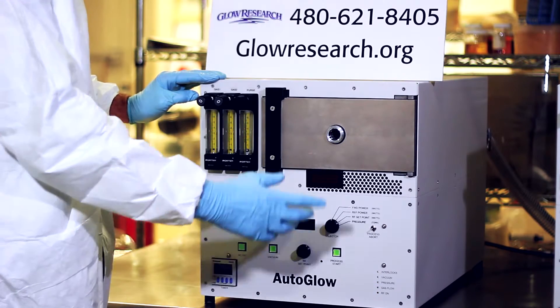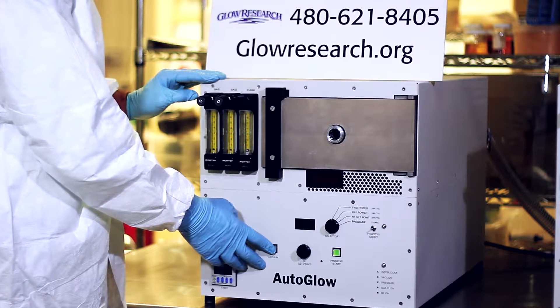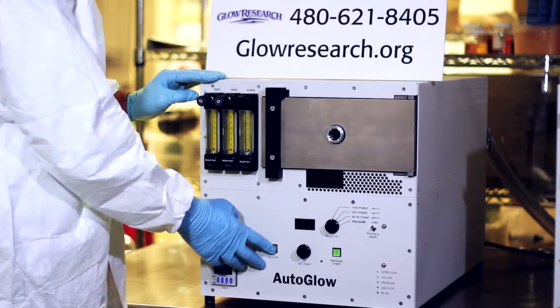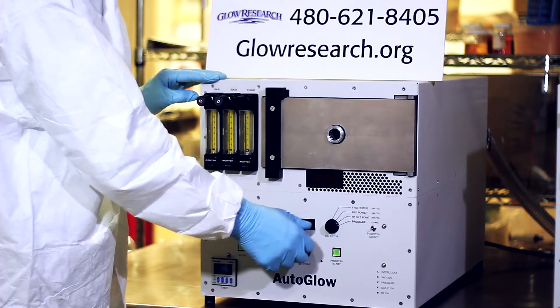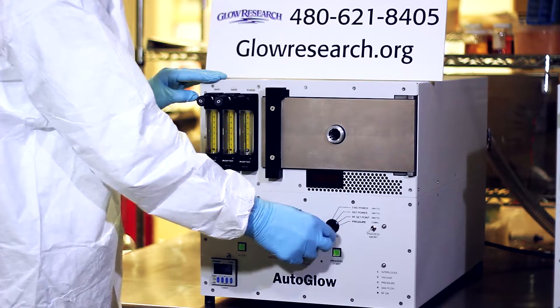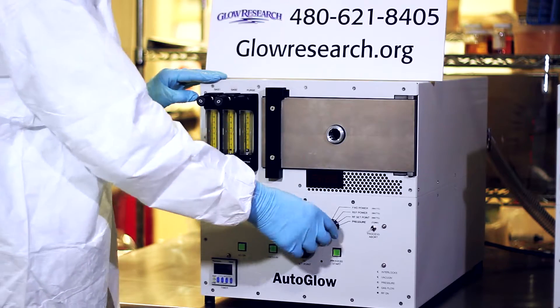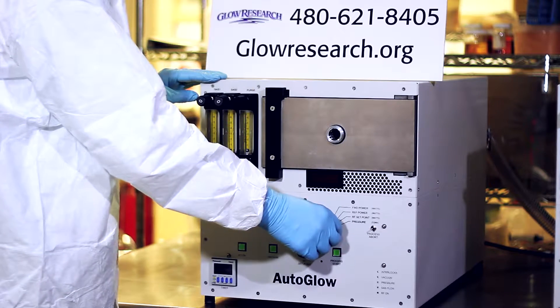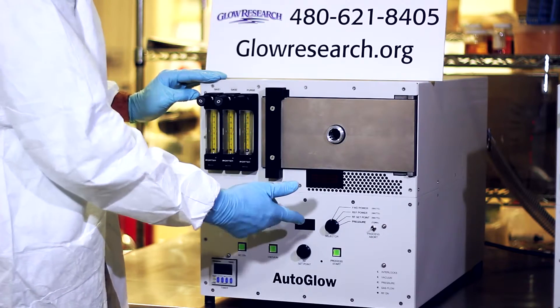I'll describe the operation and we'll come back and actually turn it on. Here's the AC on, then you would press your vacuum which would close the vacuum valve allowing the chamber to pump down. Here is a selector switch where you can select the pressure. We have a Pirani gauge to give you a very accurate reading of the pressure. Here's where you set your RF power. Here is the reflective power, which is always extremely low due to the design of our system and also the matching network. Here is the forward power actually going into your chamber.